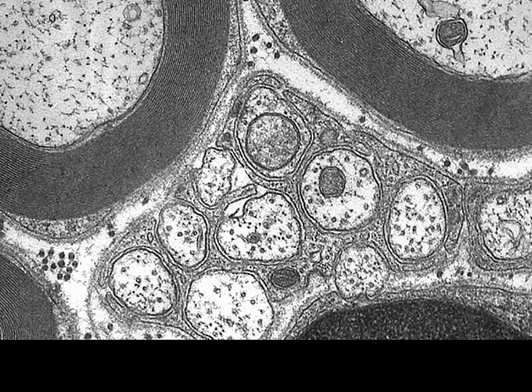Here we're looking at a higher magnification. Again, we can see our very prominent major dense lines. Really can't see the interperiod lines in these, but here is an axon, and it's associated with the cytoplasm of this Schwann cell.